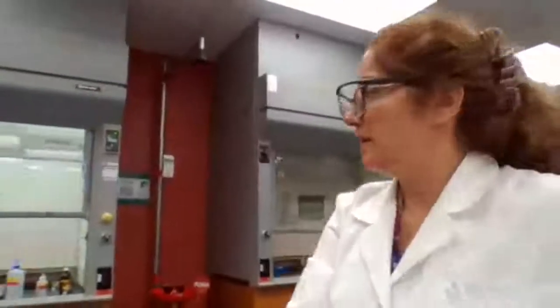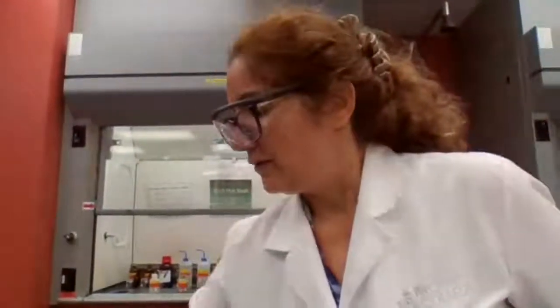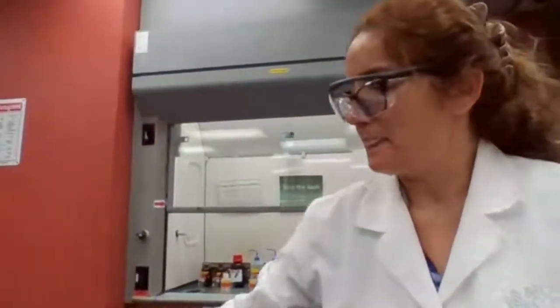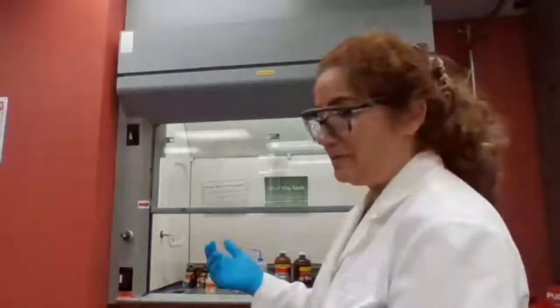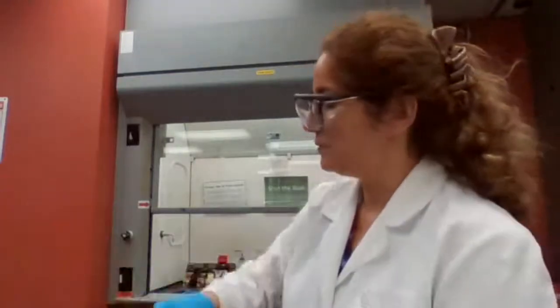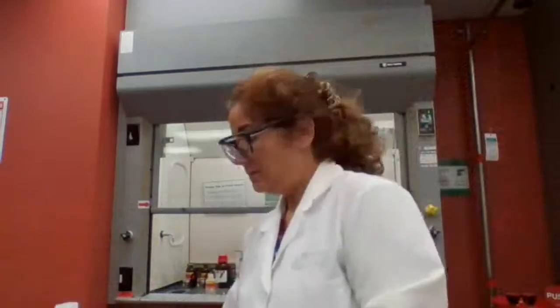Solubility and Hinsberg test. Okay, for solubility, I can do one of the amines or all three of them, but for Hinsberg, we have to do all three of them, okay? For solubility, first solubility would be in water.